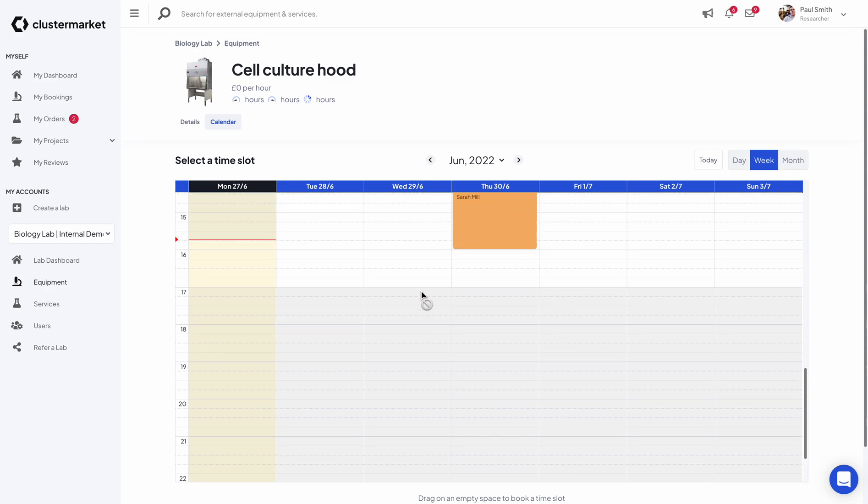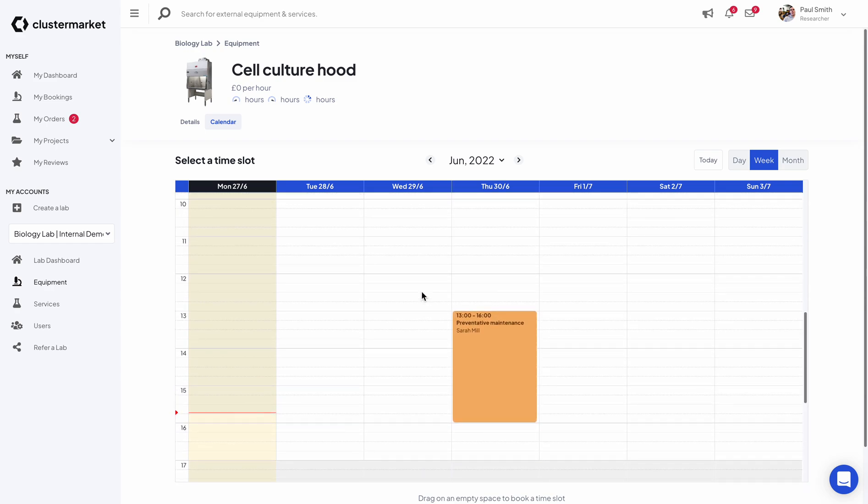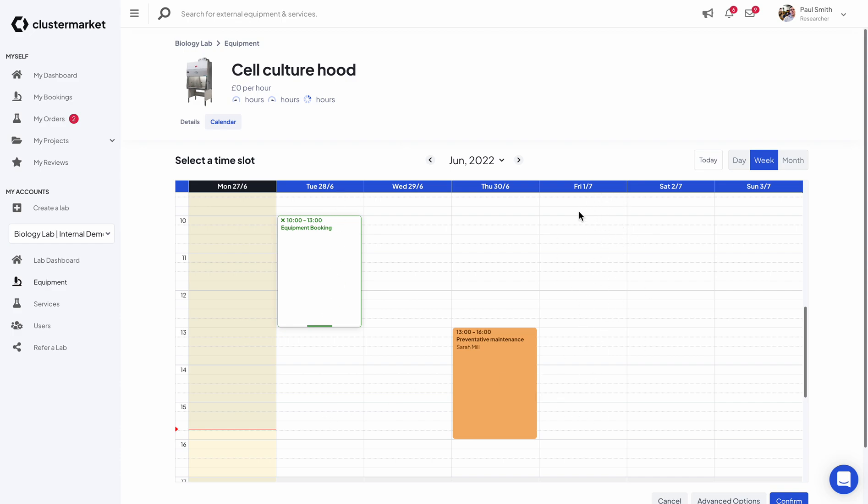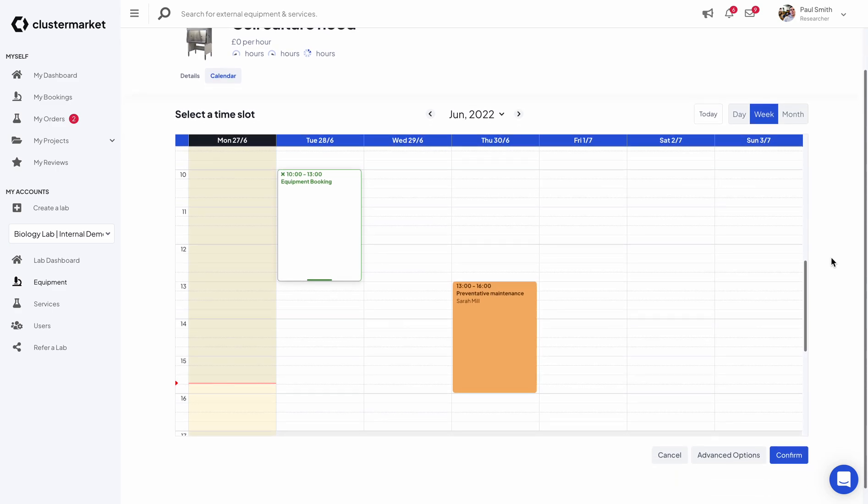I will be needing it from 10 to 1 p.m. every Tuesday and actually every Friday. But the way I'm going to book Friday is going to be in a different way.